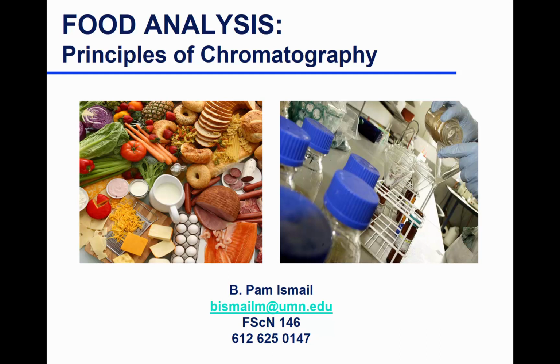So basically, this is what chromatography is about. In order to separate, you want to make sure at least one component interacts with the phase. The other one is interacting less or not interacting, so they will leave the column either right away, or before the other one. In order to get the one that strongly interacted with your material in the column, you change the solvent, you change the mobile phase, and put something in there that makes that compound interact with the solvent, so it will just walk out of the column with that solvent.